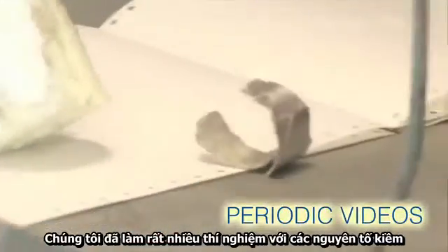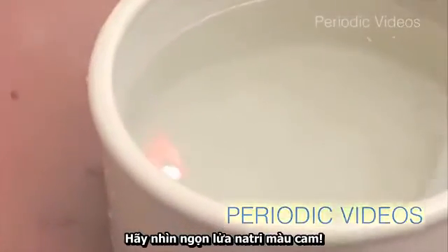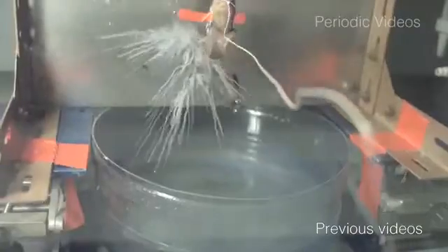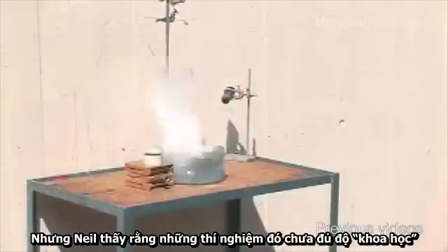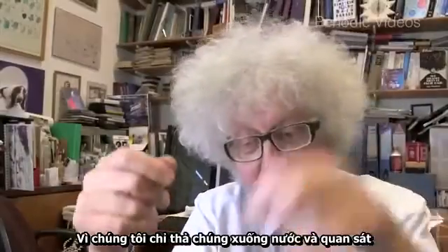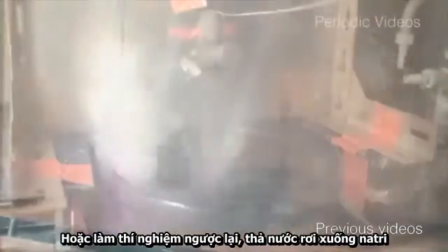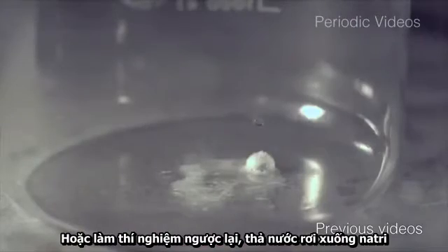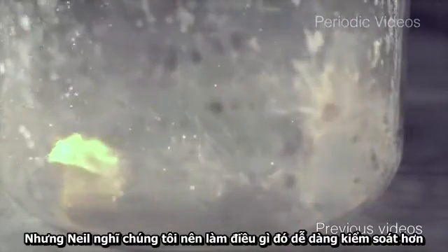We've done lots of experiments with the alkali metals. We'll pop it into the water and see what we can do with the reaction. You can see the orange sodium flame. But our technician Neil felt that we weren't really doing them scientifically enough. We were just dropping alkali metals into water and seeing what happened. We've also done the reverse experiment — water falling onto sodium — but Neil felt we should do something much more controlled.